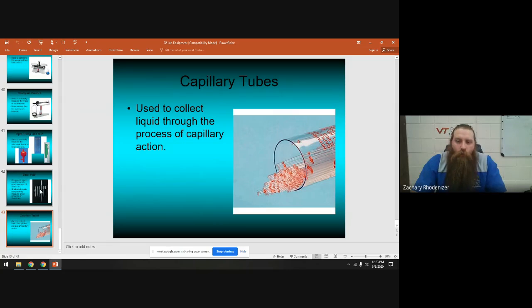Capillary tubes have an extremely small opening, and capillary action pulls liquid up into them. You can use them to get a sample for the melting point station, which is what we'd use them for if we get there this year. Those are the main tools we use in chemistry. Make sure you know what each one is used for — and what not to use it for. Know the right tool for length, mass, and volume — those are the big three.